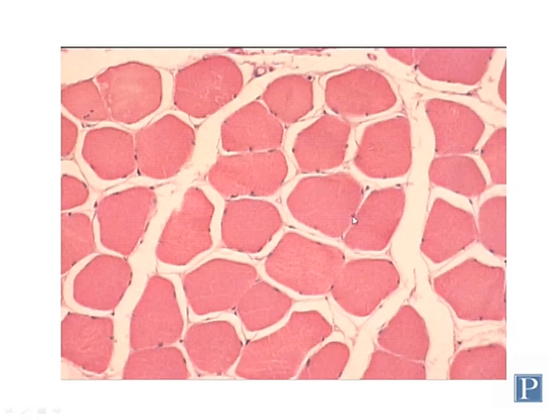The nuclei are found at the periphery of the cells, so because they have many nuclei, you can see these nuclei in almost every single cross-section of each of these skeletal muscle fibers. And you won't find the nuclei at all in the center of the cell. They're only along the periphery, because the center of the cell is packed with lots and lots of contractile protein filaments called myofibrils, not myofibers.